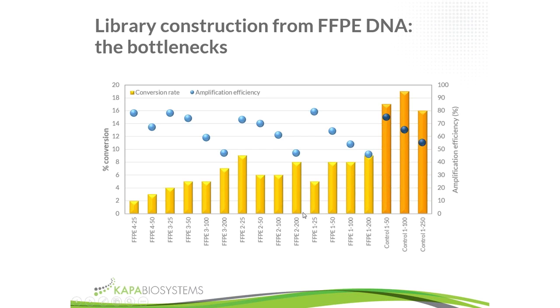And so for the different data sets, we had different types of upfront QC data available. In this specific experiment, these samples had been previously sequenced, and so we just arranged them in order of increasing quality based on the outcome of previous sequencing. We had a total of 4 samples here, and in this case we processed different inputs, so 25 or 50 nanograms, and if there was enough sample, 100 and 200 nanograms. So essentially these are multiple libraries prepared from the same sample.